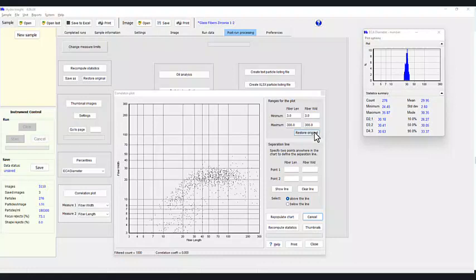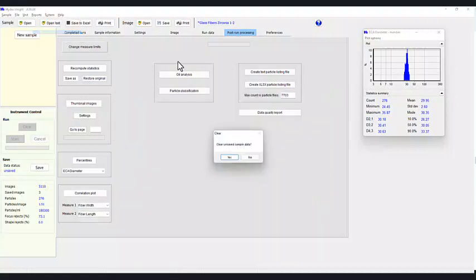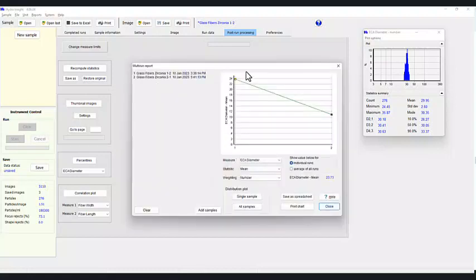So I just restored the original. Let's go ahead and restore the original data and repopulate the chart. Do a quick overlay where I can do a comparison. I had already opened these two, which are Zirconia 1 and Zirconia 2. These are two different samples of the same nature, but they were two different samples. So it looks like there's a process difference between the one and the other. So I opened these two, and I can do a comparison of anything.